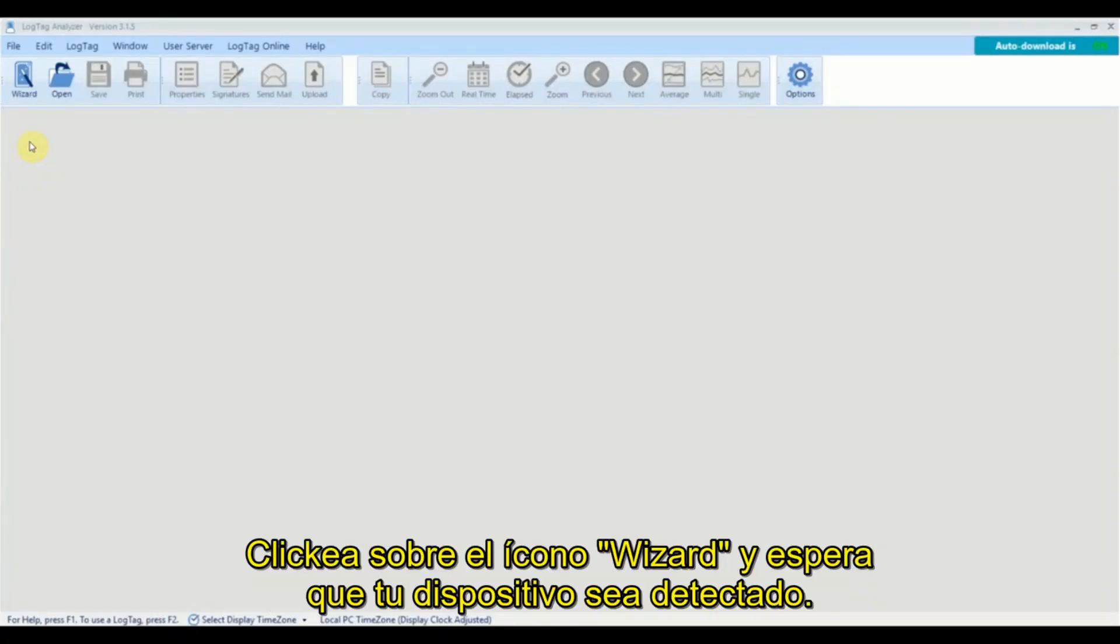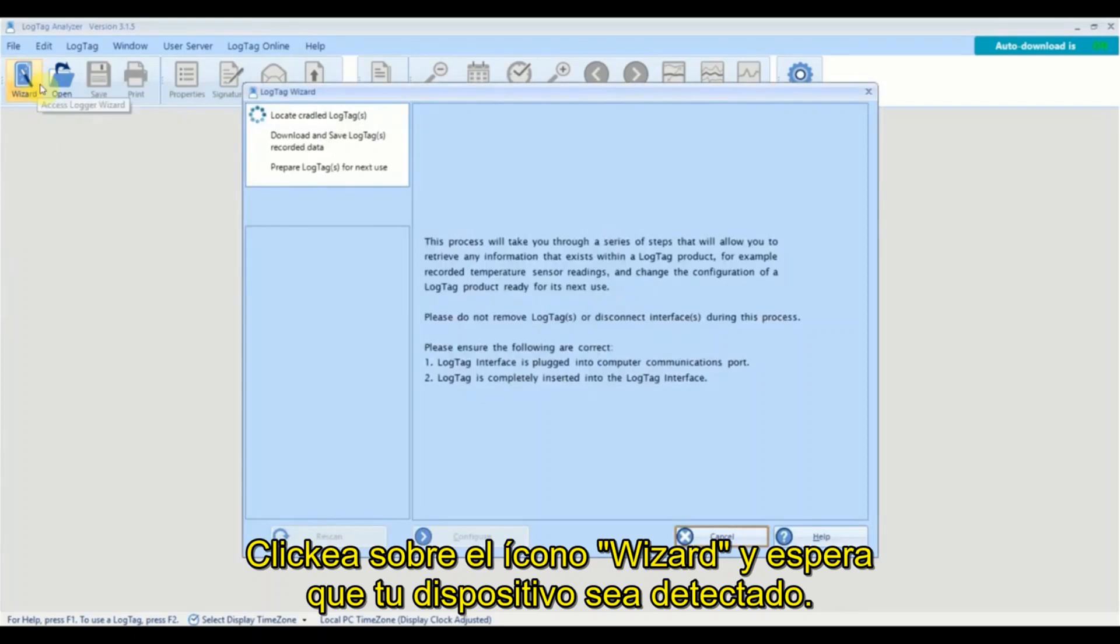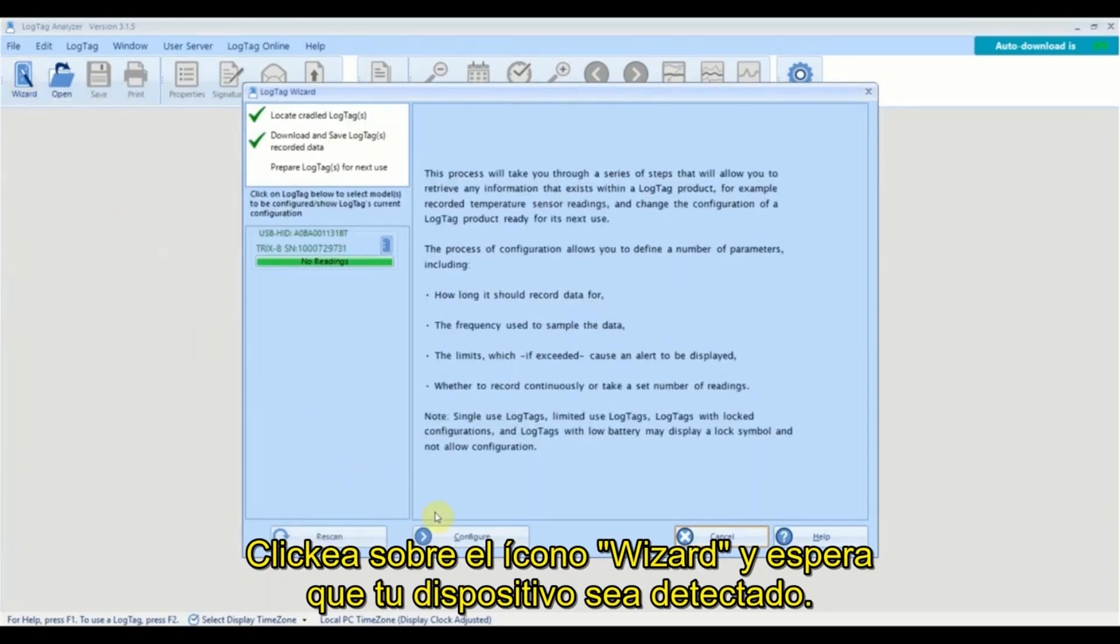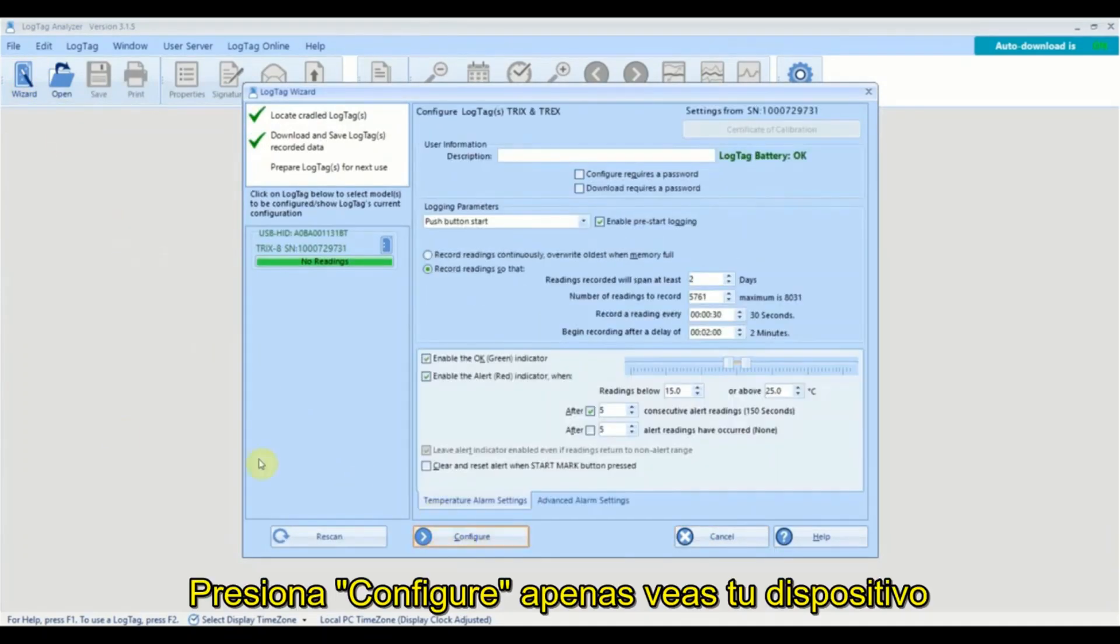Click on the wizard icon and wait for your device to be detected. Click configure once you see your device.